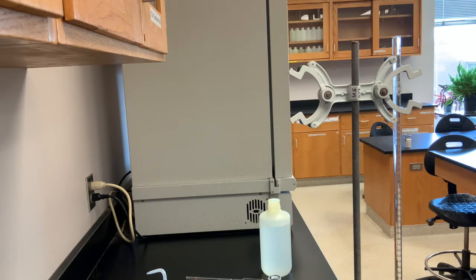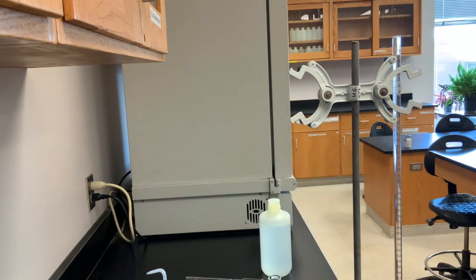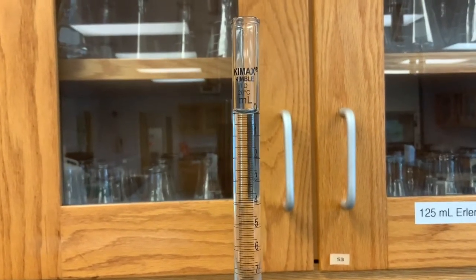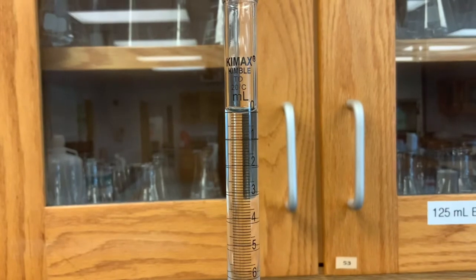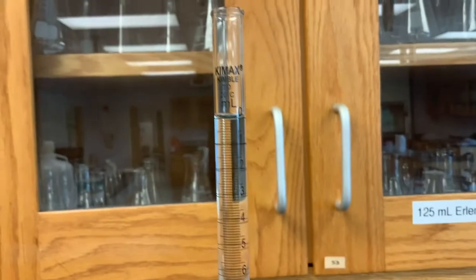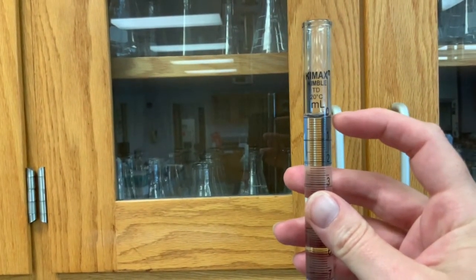So what we're gonna do is release some of that sodium hydroxide into our beaker here so that we can get to our zero mark. So we've released some of the liquid and now we can see that we're at about that zero mark. We wanna go ahead and record. This is our initial volume. Remember when we're recording and measuring this liquid volume, we're measuring from the bottom of the meniscus. So, bottom of the meniscus, down in here.